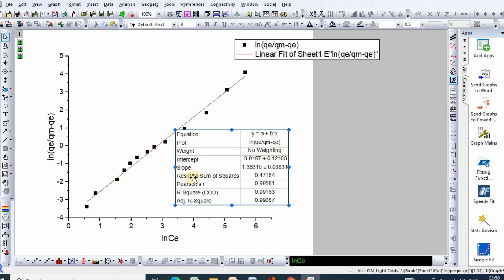So, here is your slope, which is n, n equal to 1.38. And from intercept, you can easily calculate K. So, this is how we can fit linear Toth isotherm using Origin Pro.